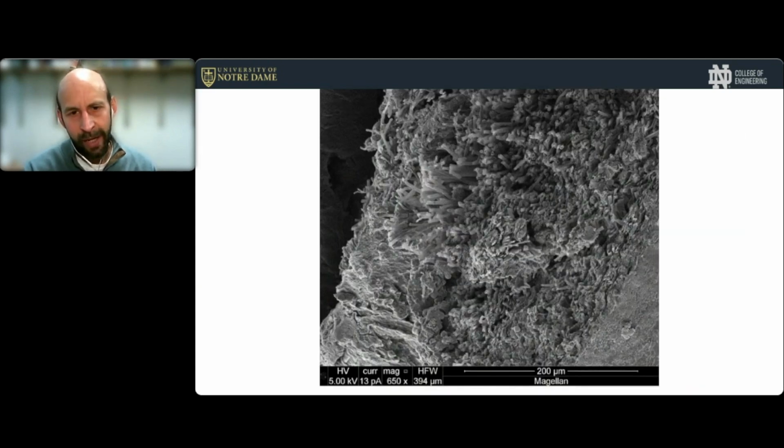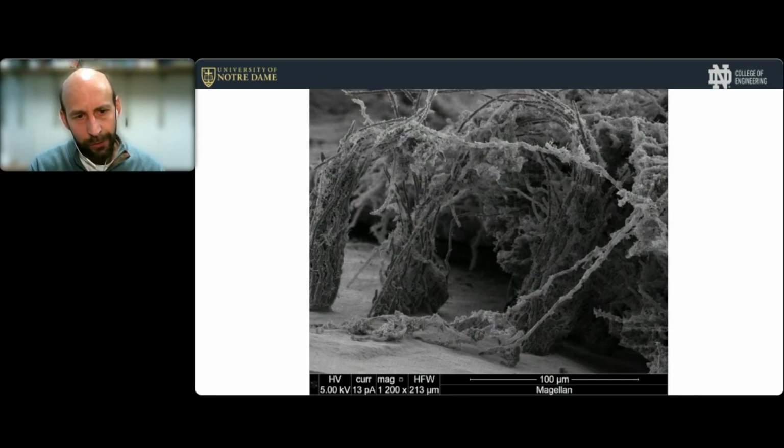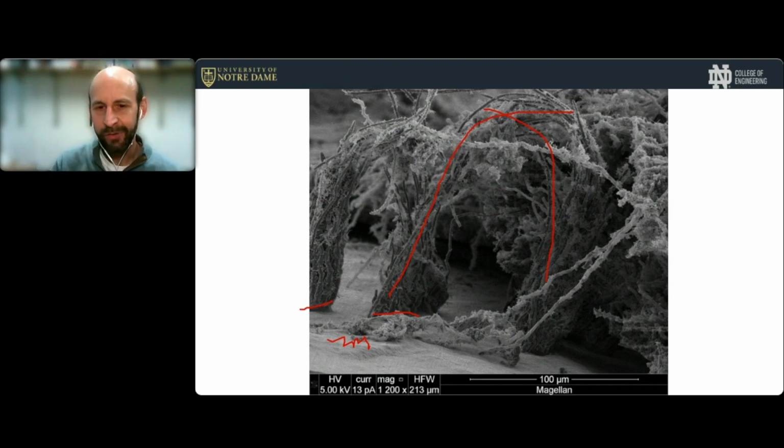And when looking at this with SEM, we saw these massive bundles of filaments. So these kind of tubular structures formed in the biofilm. If we look a little even closer, we find that this surface here is the gas transferring membrane, and they almost seem like they're embedded in the membrane and growing outwards and forming canopies in the biofilm. So we were really surprised to see this. Initially, we thought maybe they were cable bacteria that can transfer electrons through conductive filaments, but they didn't match the phylogeny of cable bacteria, and the morphology was different too.